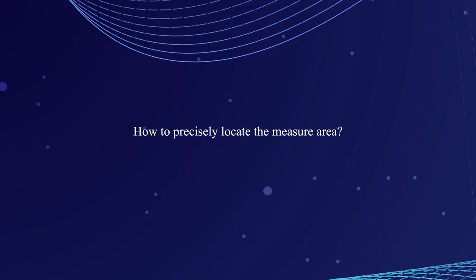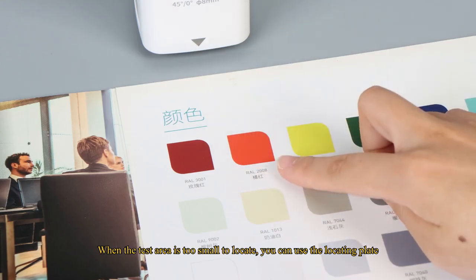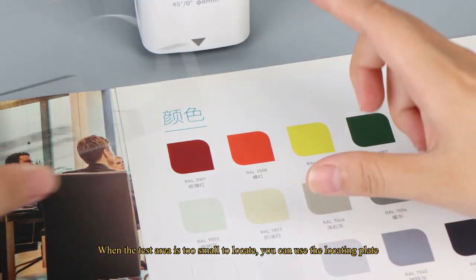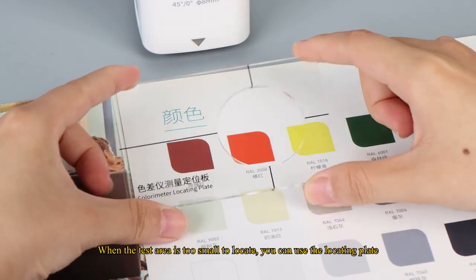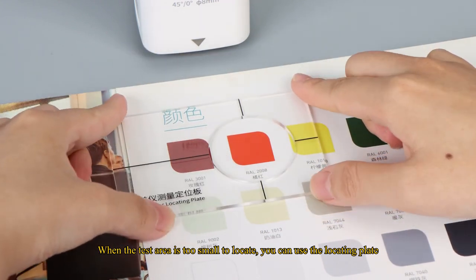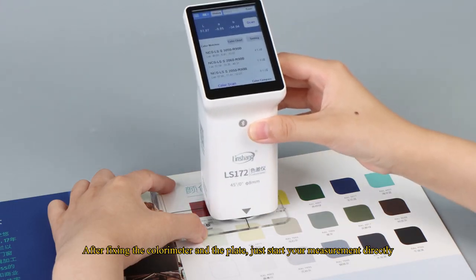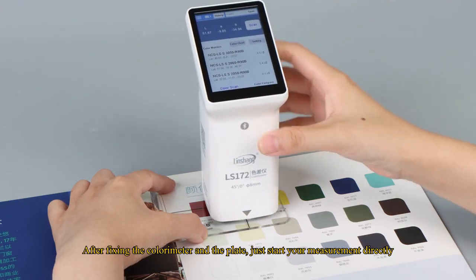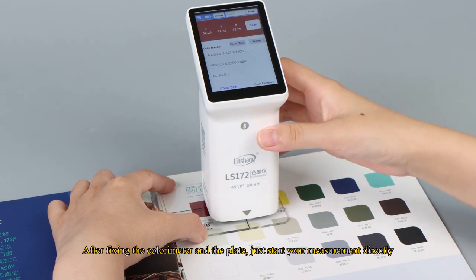How to precisely locate the measure area. When the test area is too small to locate, you can use the locating plate. After fixing the colorimeter and the plate, just start your measurement directly.